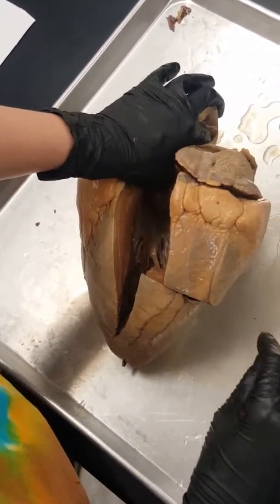Over here is our tricuspid valve — it's kind of hard to see because we opened it on a weird spot, but we have three flaps. When this is closed, those flaps open and shut to allow the movement of blood. This is our right ventricle — you can kind of see the flaps under my fingers, which is where the chordae tendineae are going to be attached.